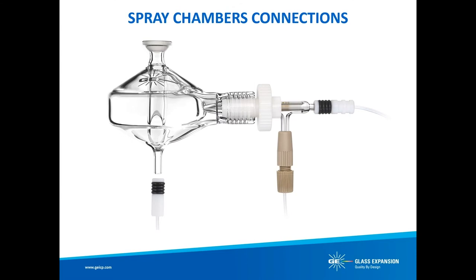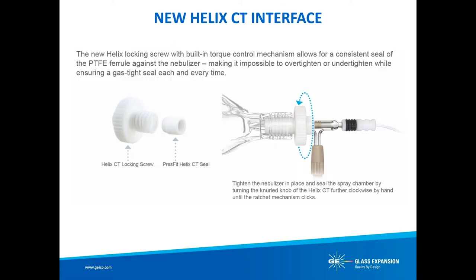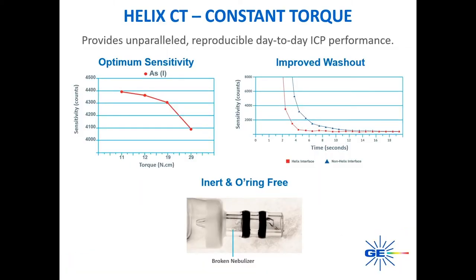Now let's look at a few spray chamber connections. While several features of Glass Expansion spray chambers were discussed in the Spray Chambers 101 webinar, two are relevant today: the Unifit drain connector and the Helix CT. Glass Expansion's Helix CT locking screw with built-in torque control mechanism was released in 2018. This unique nebulizer interface allows for a consistent seal of the PTFE ferrule against the nebulizer, making it impossible to over-tighten or under-tighten while ensuring a gas-tight seal every time. ICP sensitivity is affected by nebulizer depth within the spray chamber and the torque applied to the nebulizer seal. The combination of torque control and positive stop — which fixes penetration depth — allows the ICP analyst to achieve the same nebulizer performance every day.